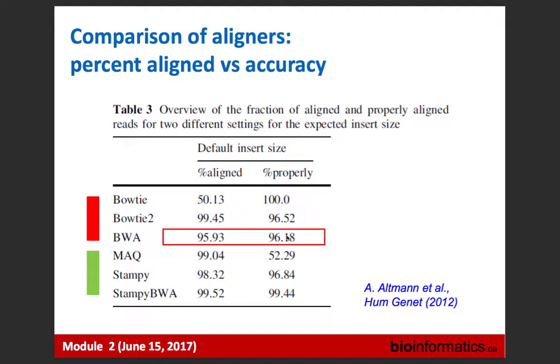and you have too many SNPs, which do not allow quite a few reads to be aligned. So maybe you change your alignment parameters a little bit to improve your alignability. But that is given. In a sense, at the end of the day, it's what you got, the quality of your experiment.